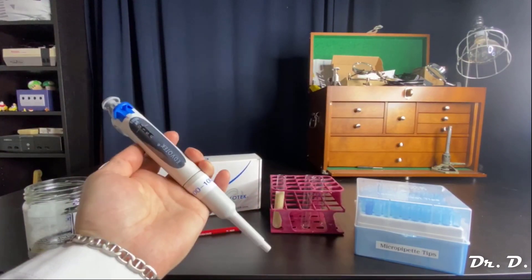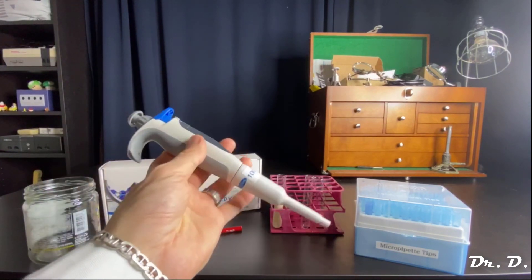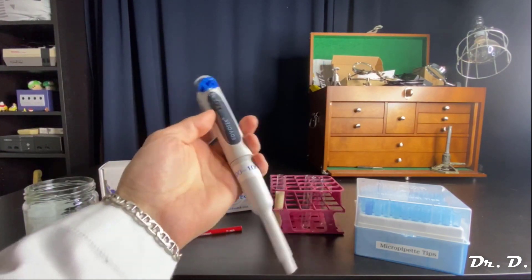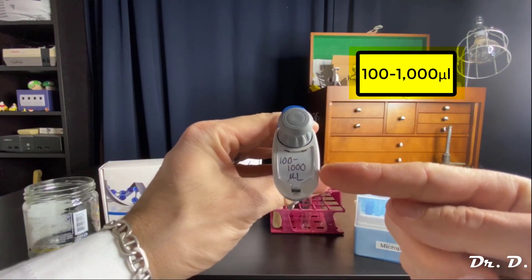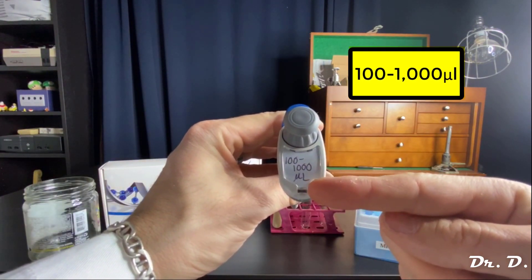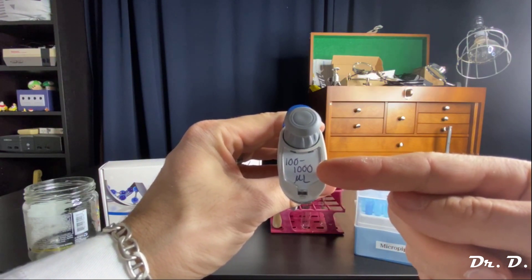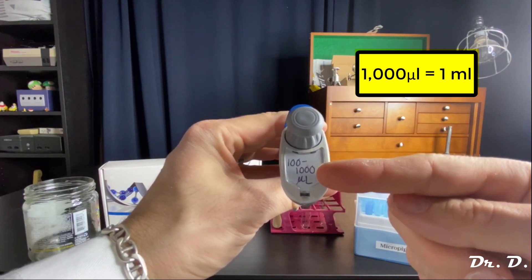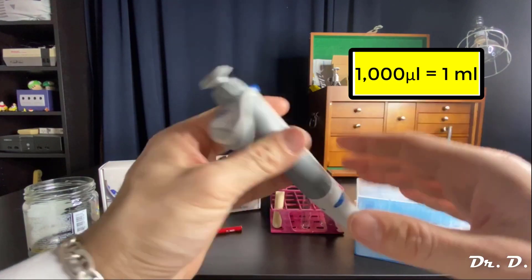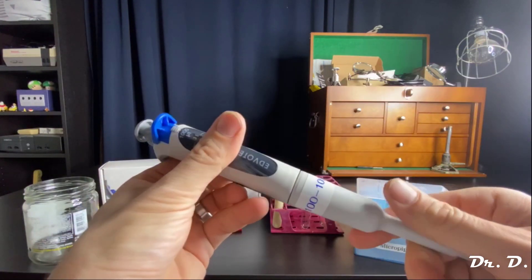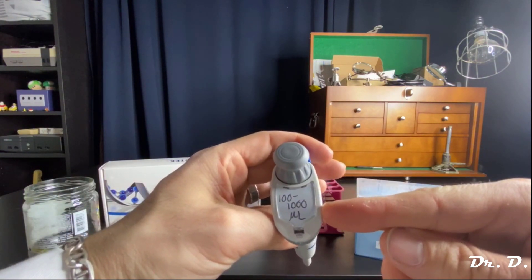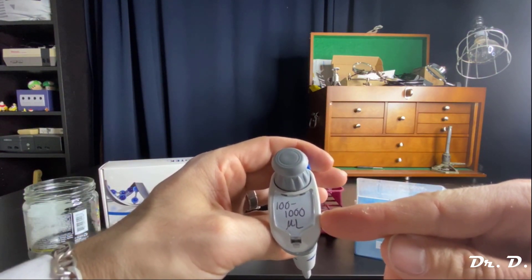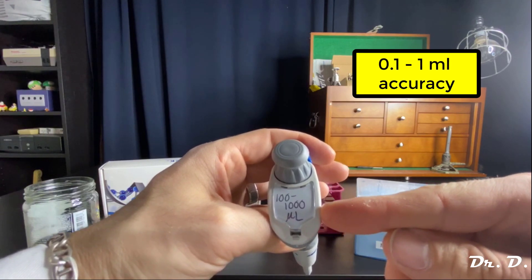Here we have the Edvotech micropipettor. This is a P1000 micropipettor, which means that it is accurate between 100 to 1000 microliters. Remember that 1000 microliters is a milliliter. So this pipettor is accurate between 100 and 1000 microliters, which means 0.1 to 1 milliliters.